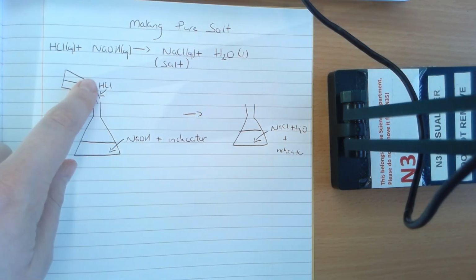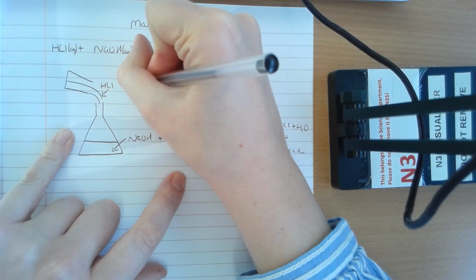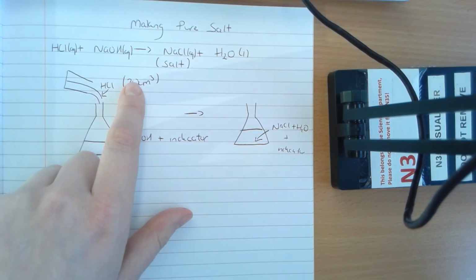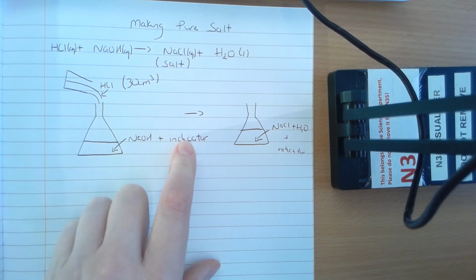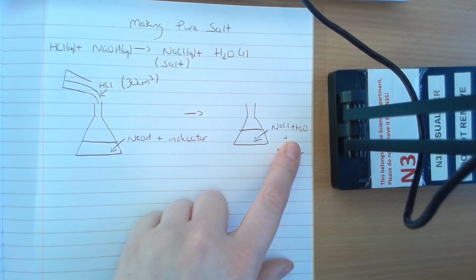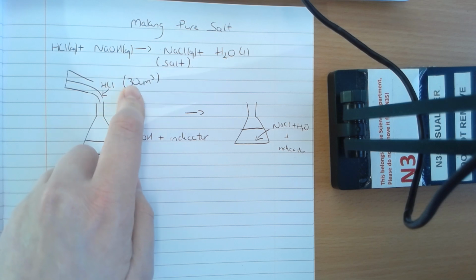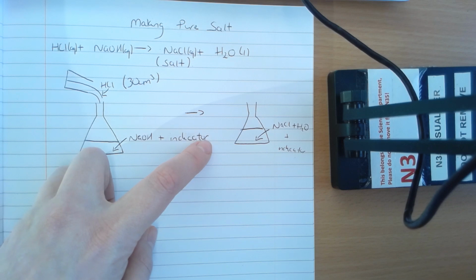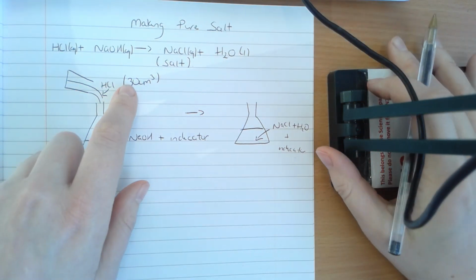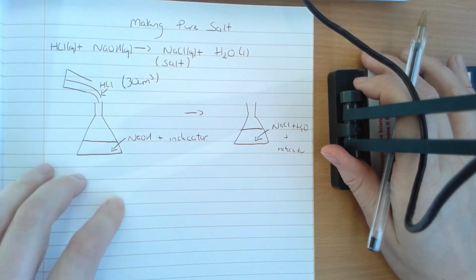Now, if you're using a beaker, you'll say, I added roughly 30 centimeters cubed of HCl in order to get that color change. Okay, when you take the indicator away and do the practical again without the indicator, this is what you're basing it on. You're basing it on the fact that you think you added 30 centimeters cubed when you did have the indicator change color. But the resolution on a beaker is not high enough. That's not an accurate value.